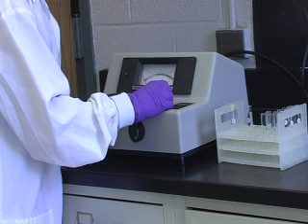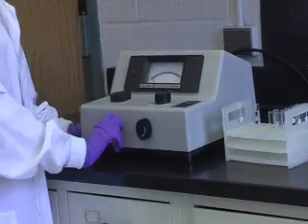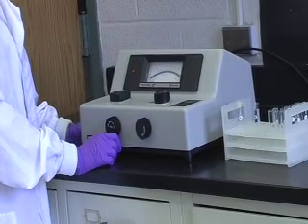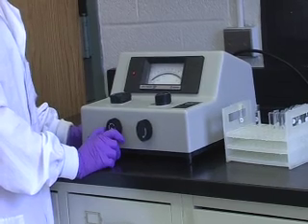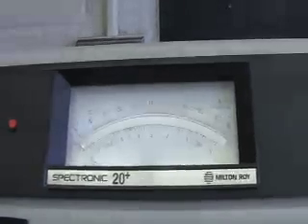Select the desired wavelength with the top right knob. Make sure the sample chamber is empty and the lid is closed. Use the left front knob to bring the needle to the 0% transmittance or infinite absorbance line on the left of the scale. This zeroes the spectrophotometer.